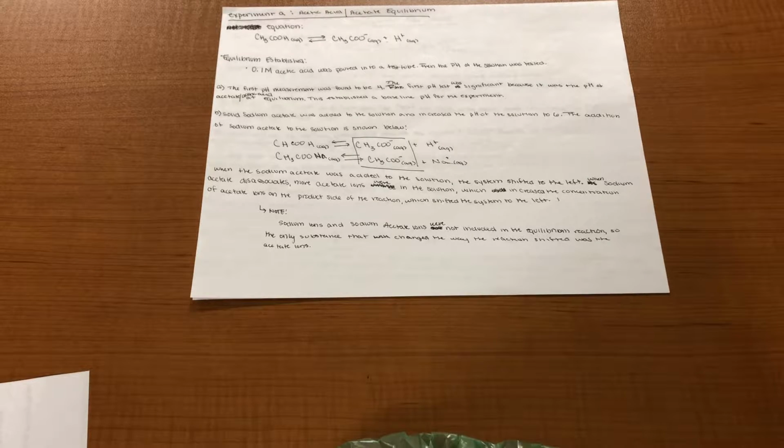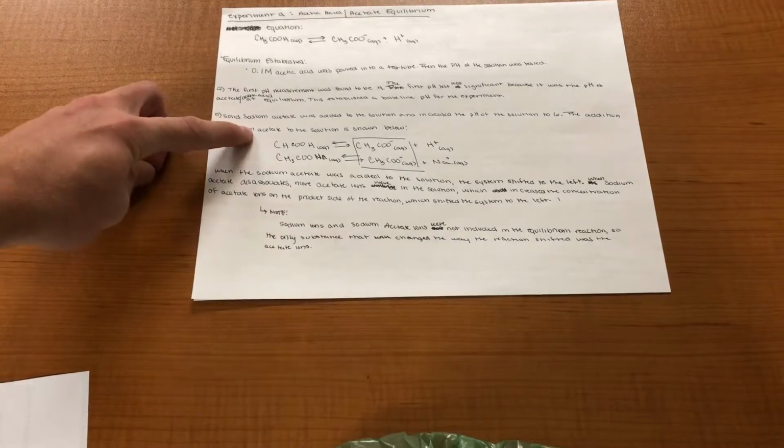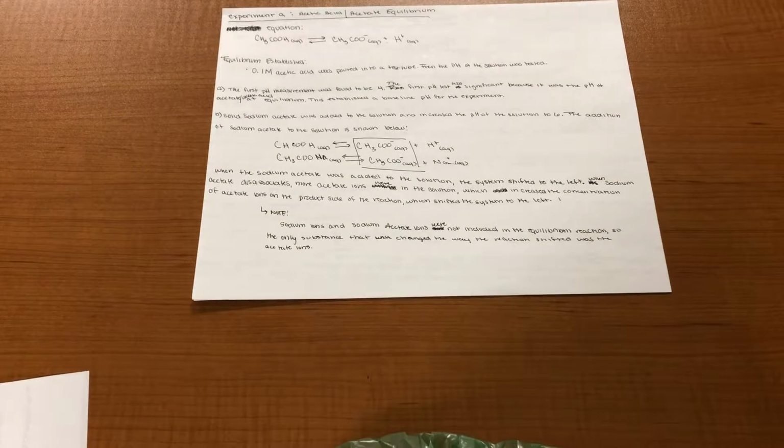Solid sodium acetate was added to the solution and increased the pH of the solution to 6. The addition of sodium acetate to the solution is shown here. When the sodium acetate was added to the solution, the system shifted to the left.